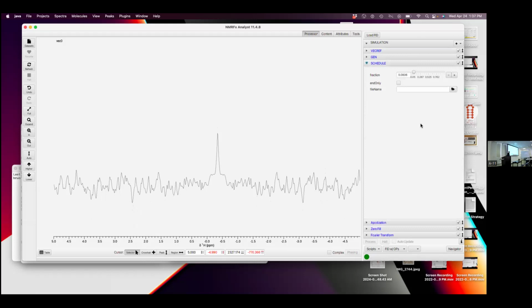And I'm going to ask you a question. So right now we're at 8% sampling. If I raise the sampling higher and higher and get closer to 1, what's going to happen to the spectrum? The noise will decrease. And the signal will increase. Very astute. You think that's really what happens? Let's find out.